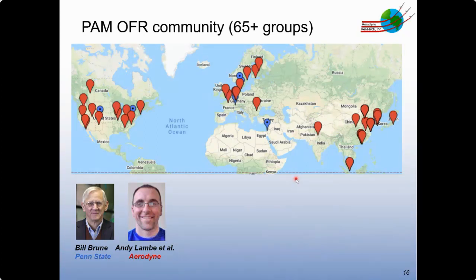So all of the other designs that I summarized in an earlier slide are mostly custom home-built configurations. Here, we have established a community that uses basically the same technique as we have with the AMS and ACSM and all of our other research instruments around the world, so that everyone is using basically the same hardware and doesn't have to develop that and can just instead focus on using the OFR for its specific applications.